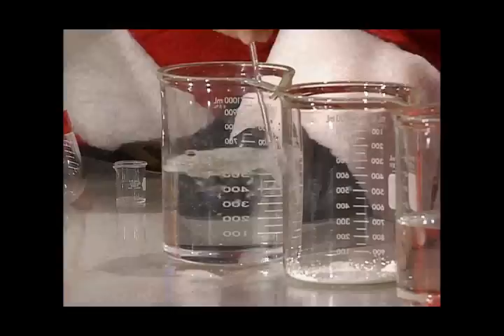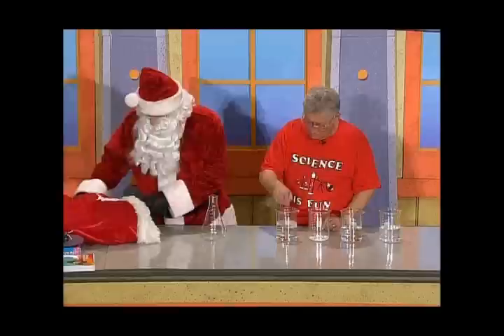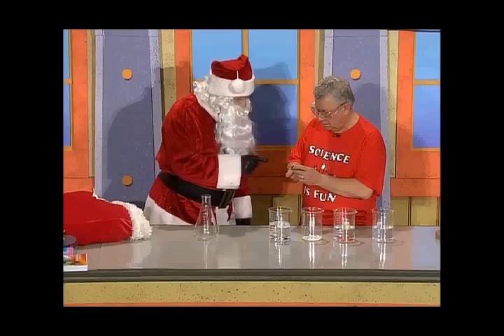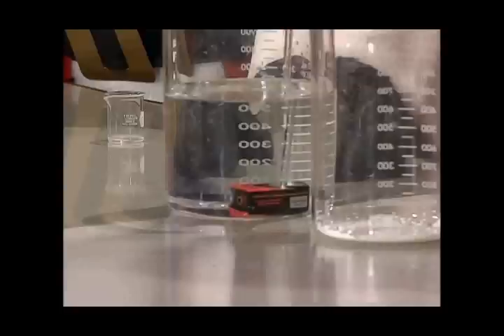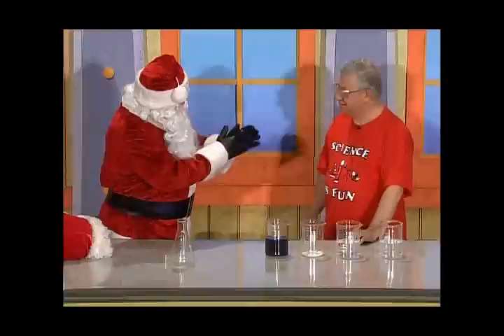Well, you know, I need a little help to make this happen. I wonder, Santa, if I could borrow something from you. I know you have a lot of toys in your bag. Could I borrow a battery from one of the toys in your bag? Oh, yes. This little girl, she had a battery. It's a 9-volt. Will that work? Okay. So here we go. I'm going to put this in there. And what color do you see now? It's turning blue. Look at that. Yeah, this is a battery-operated chemical reaction. Oh, wow. Look how blue that is. That's great. Good job.